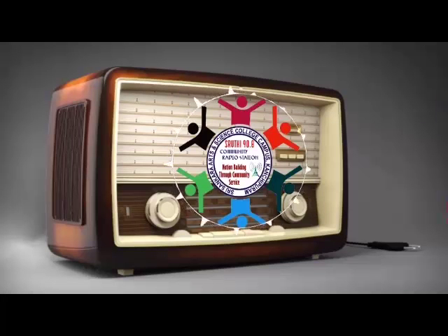These batch bioreactors are commonly used in the production of many microbial metabolites in industry as well as in the research laboratory, and also many pharmaceutical products. The advantages of batch reactor are flexibility. We can easily perform the batch reaction, and also it is easy to operate and has relatively low cost of equipment and maintenance. The major remarkable feature of batch reactor is the possibility of using it directly in the research laboratory. These are the major advantages of this batch type reactor.